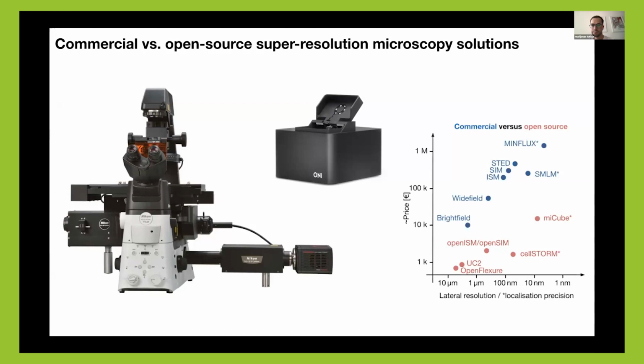People started to develop different projects. One of them is called miCube, developed by Hannes Hohlbein. There are also other cheaper solutions, ranging from a few thousand to 50,000 euros, depending on the equipment that they are using.